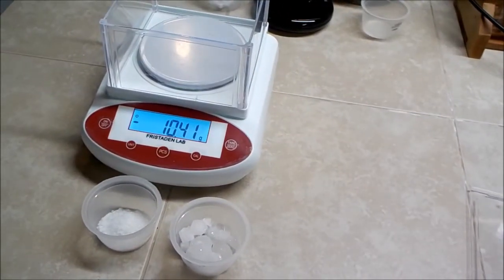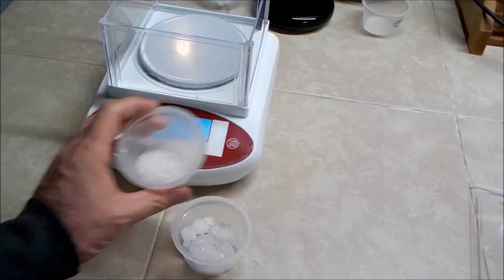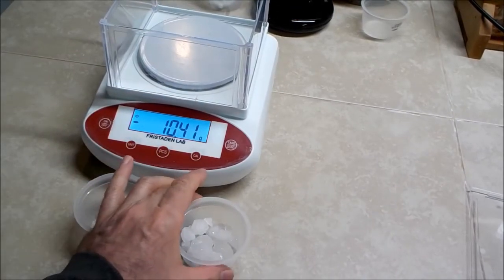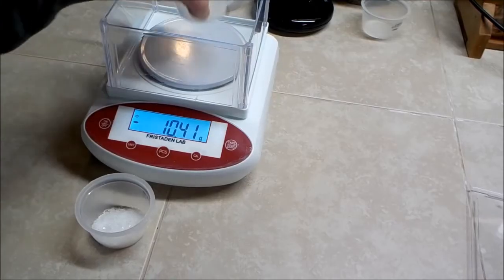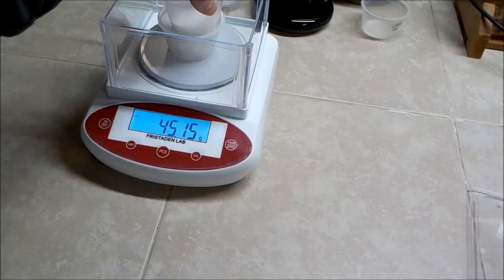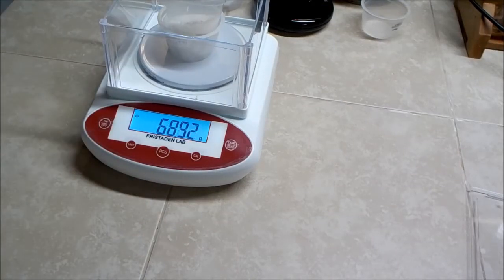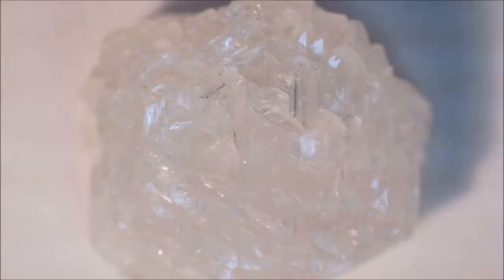After all of the crystals have dried, I've separated out the larger ones from the smaller. I may try and recrystallize the smaller ones later. I weigh the crystals and compare the theoretical to the actual amount. The calculation shows that I have a 99.4% yield, which seems a little too good to be true — perhaps the crystals are not completely dry yet. Here are some magnified views of some of the larger crystals.